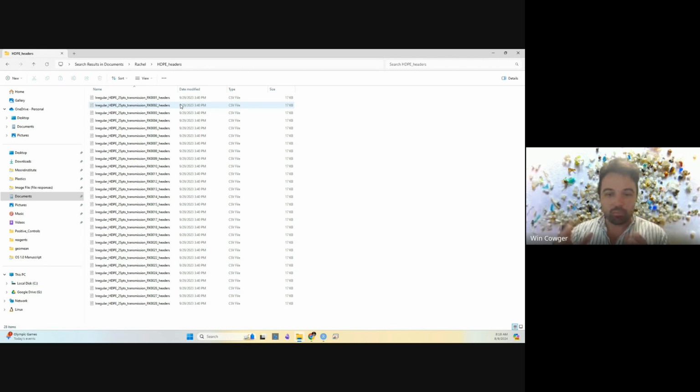We're doing one process to all spectra. So if you have some spectra that need to be converted from transmission to absorbance units, all that stuff, when you're collecting your spectra, try your best to collect them in a very consistent way, and it's going to make batch analysis easier.